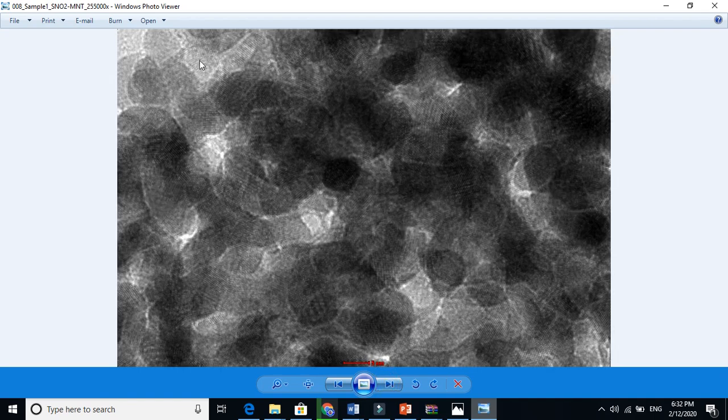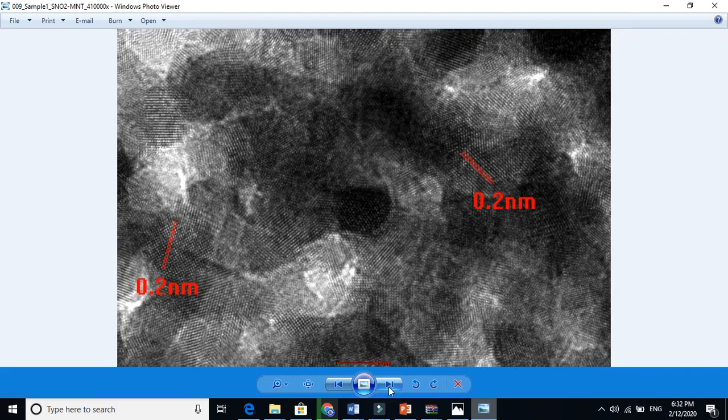When you zoom in further, you will see the planes. The grains are now clearly visible — one grain here, another grain — and this is also called a crystallite. Zooming in more, you can see they are oriented in very different directions. These planes are oriented like this, and these planes are oriented like this, and these are oriented another way. So it is clearly showing that it is a polycrystalline material.